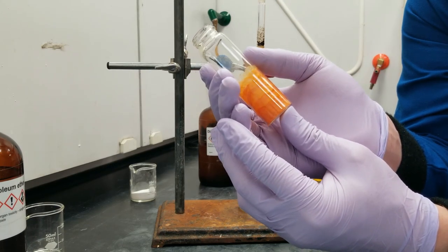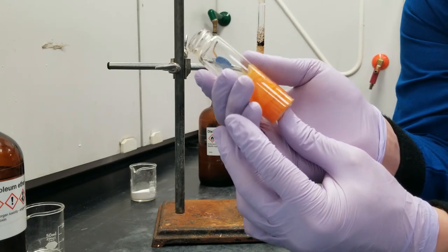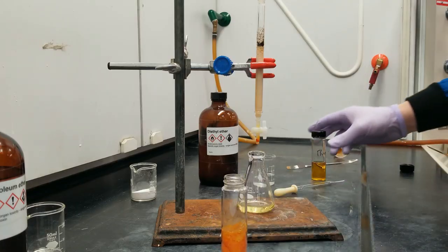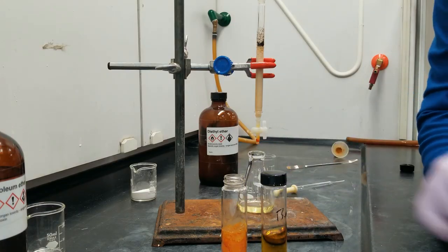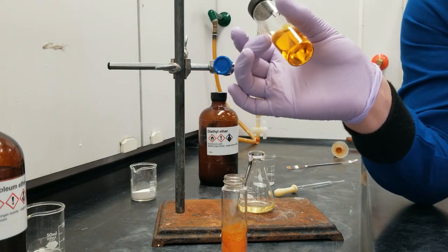So I will send the melting point and mass to you guys along with this video. But first, I need to do that exact same process again with this ferrocene that had about twice as much solvent, so this is going to take a while.